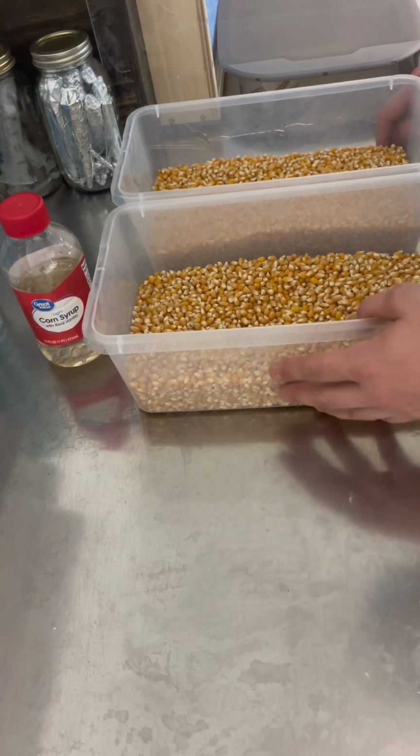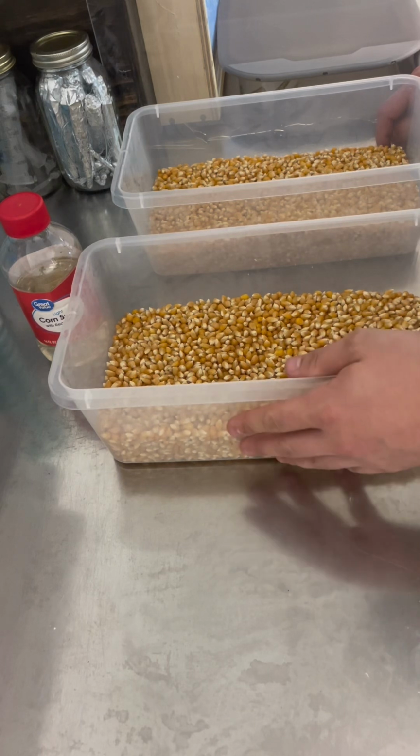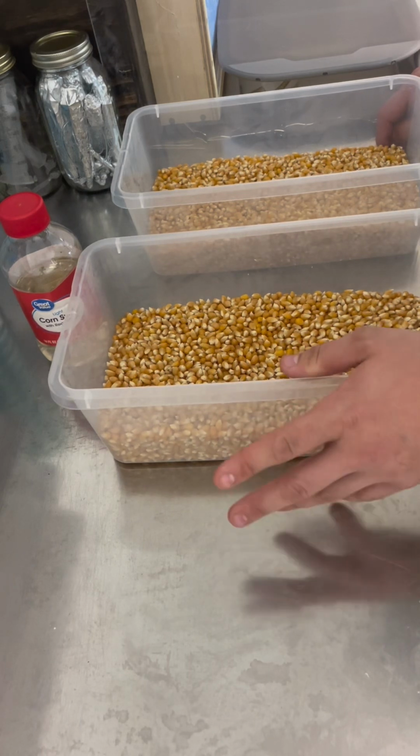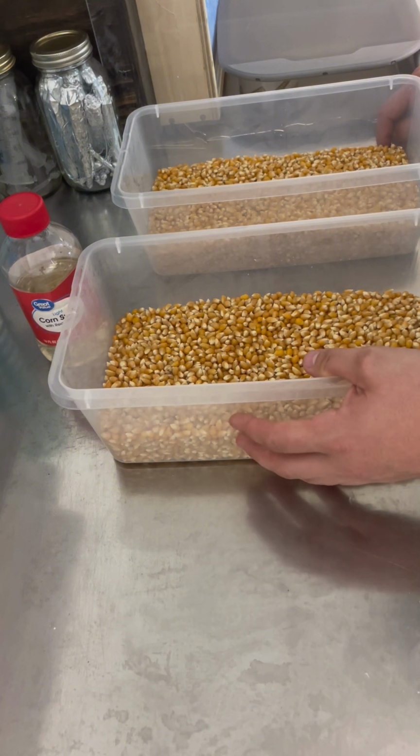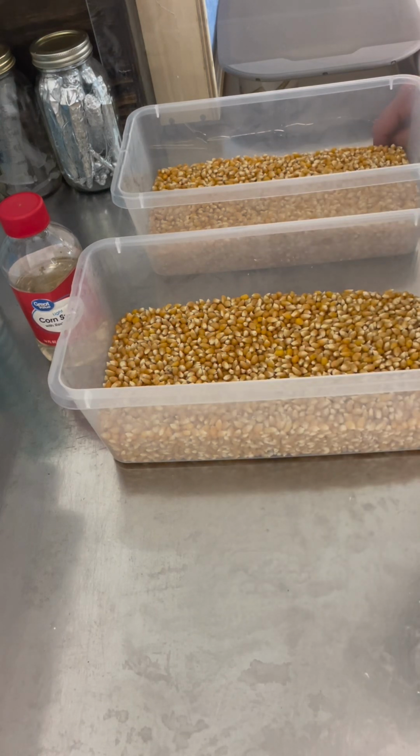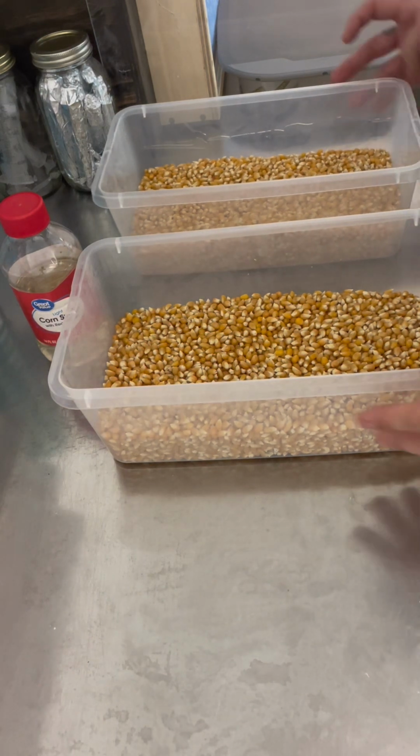I think that the drippy corn is going to be quite a bit faster, but I don't know how much quicker. I've actually only ever used drippy corn, and ever since I started using drippy corn over wheat and millet, I've seen a significant difference in how quick it colonizes. So I've been curious about this, and yeah, I want to put it to rest. So I'm going to get to it.